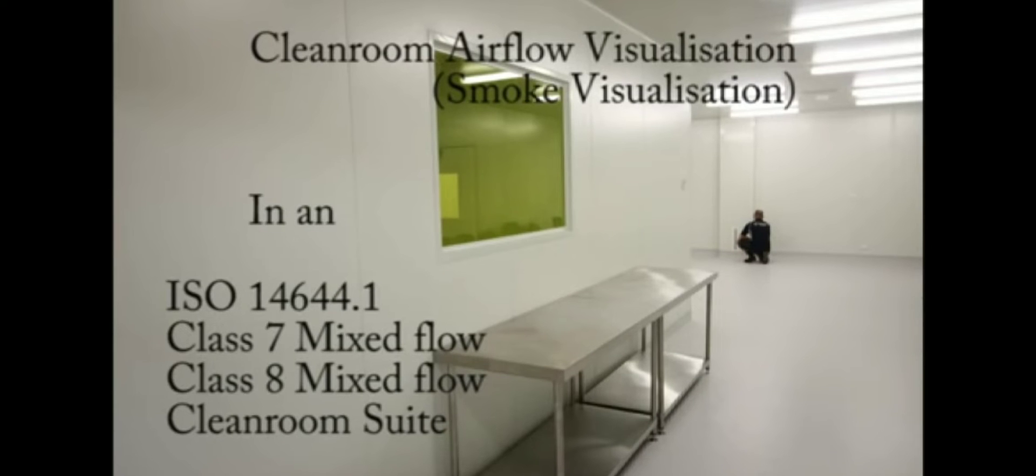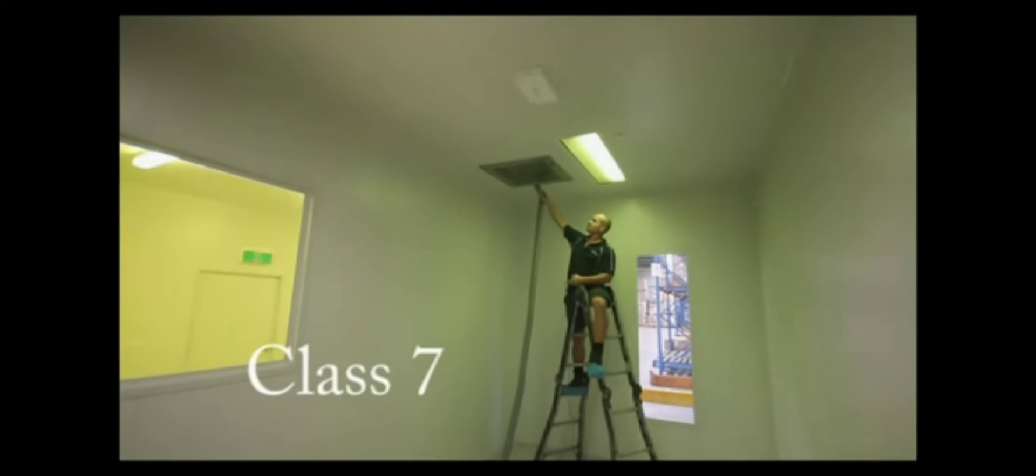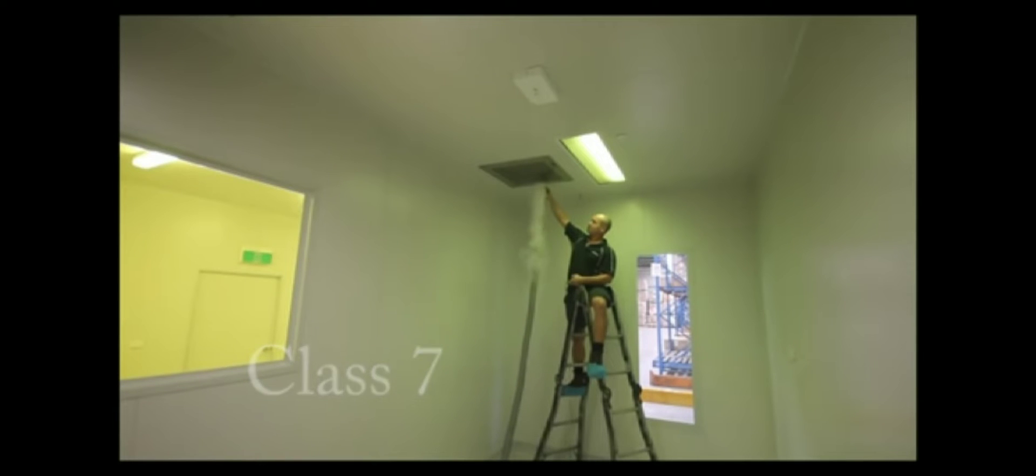I am going to take this opportunity to show you around an ISO 14644 class 7 and class 8 mixed flow clean room.